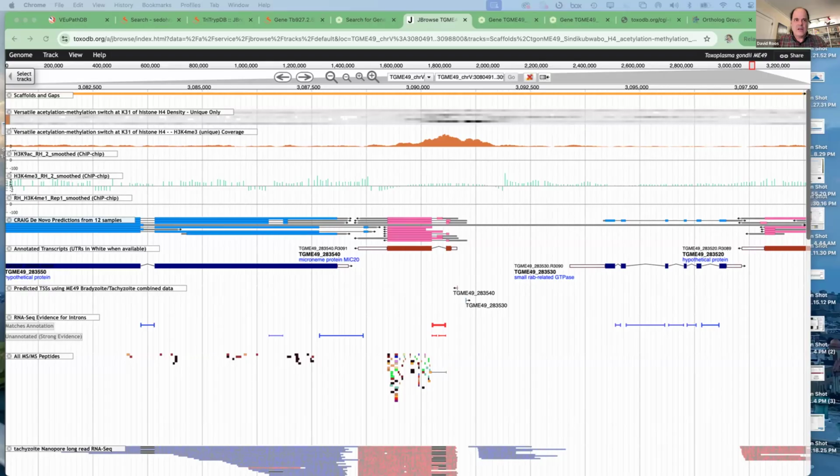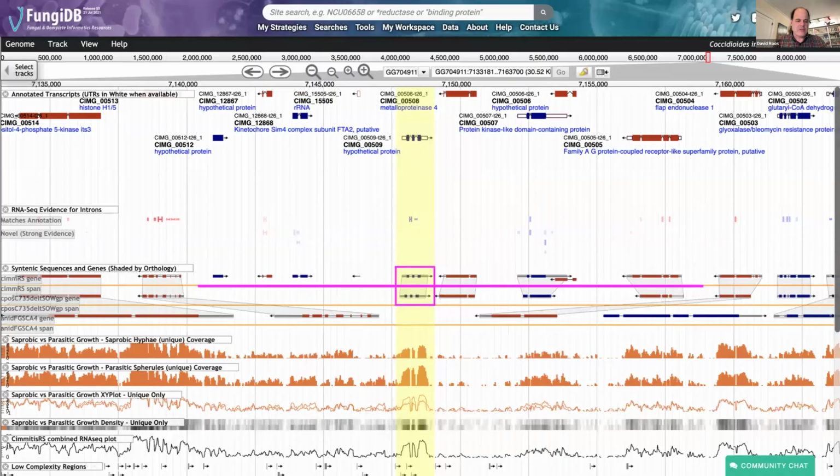But if I share my screen for just a moment, I'll show you an example from another workshop, in this case for fungi. This was an analysis not of two different strains, but of two very closely related species, Coccidioides immitis and posadasii, which were analyzed for both the free-living and parasitic forms of those fungi.